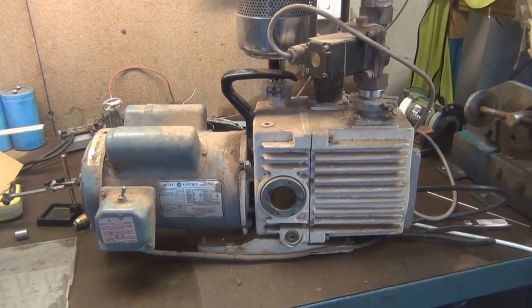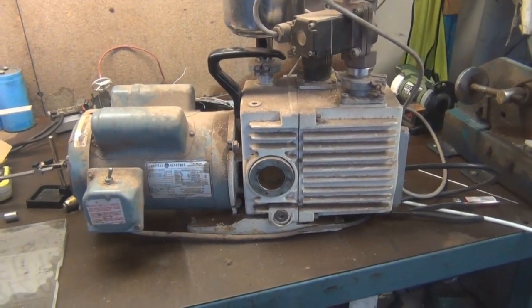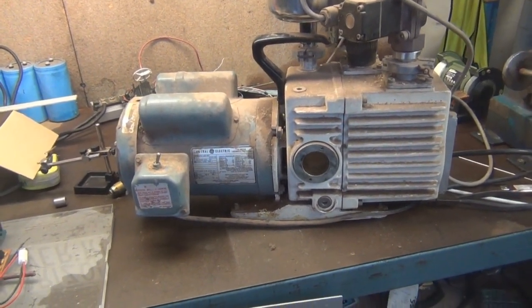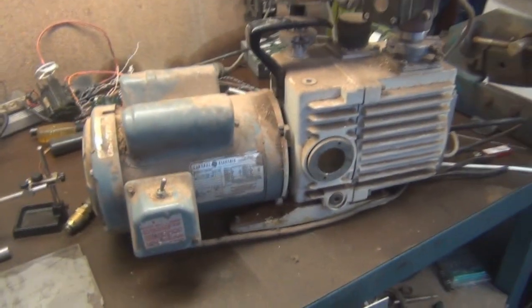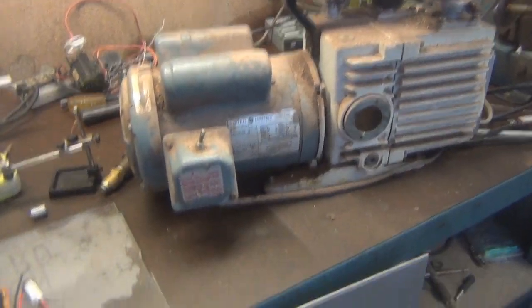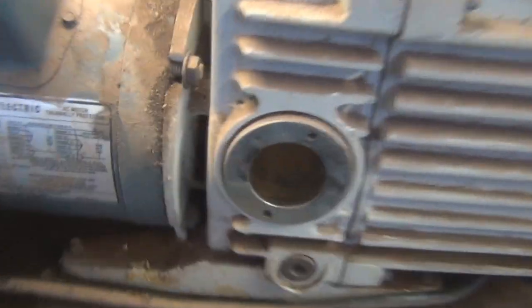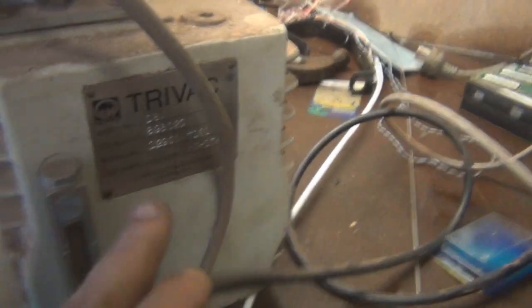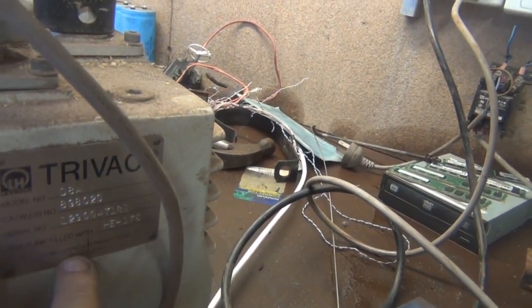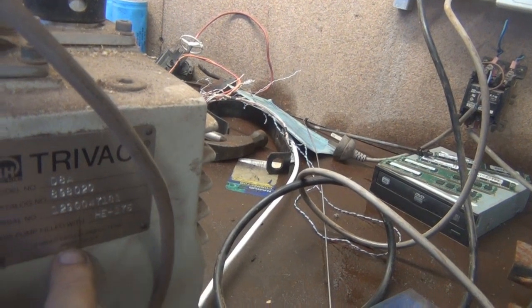G'day everybody, it's me again. I was out hunting today and I found this. I was actually looking at a forklift at a lab that went out of business, and they had this there and I basically said I want it. It's a one horsepower General Electric motor and then a Trivac D8A pump, Leibold Vacuum Products Inc., made in USA.